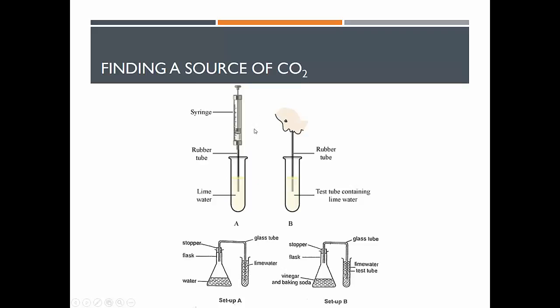Essentially, we could get a syringe of carbon dioxide and put it into lime water, and it would go cloudy. And then, just to verify that our breath does in fact have carbon dioxide in it, we would breathe through the straw, and if we know that that is carbon dioxide over here in the syringe, then these two will be the same positive test. You'll get that precipitate forming.